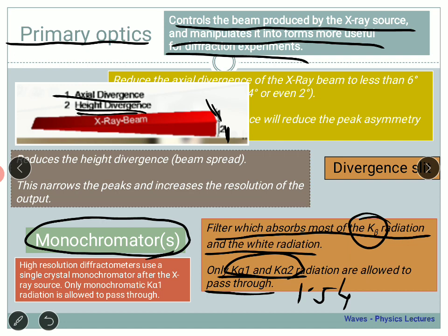Okay, now you have to understand this. I think you have already studied the sodium lamp as a monochromatic source for studying certain phenomena like Newton's rings in lab and so on. Okay, they are not perfectly monochromatic, but their wavelengths are very near to each other, 5890 and 5896. So we take the average of 5893. Similarly here also K alpha 1 and K alpha 2 are very close to each other, hence they can be considered to be almost monochromatic in nature, the source. So you have to remember this.